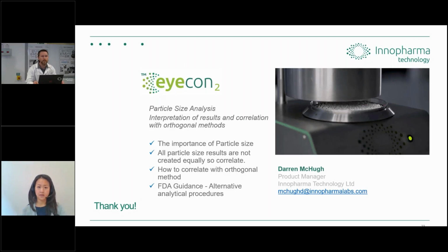The accuracy of the particles, we have a spec sheet for that. With the verification standard kits that I mentioned, we supply sizes from 50 microns to 5,500 microns, and they all have their own tolerances because of the way they're manufactured. We're able to measure within those specified tolerances. So for 50 microns, we could be talking plus or minus 10 micron accuracy, and that gets a little bit larger as you go up. If the person that asked that question is interested, I can send that sheet over with the full range of accuracy for all those sizes.